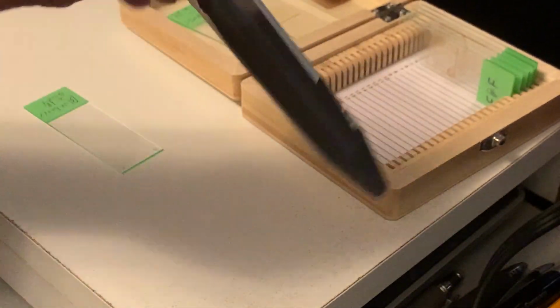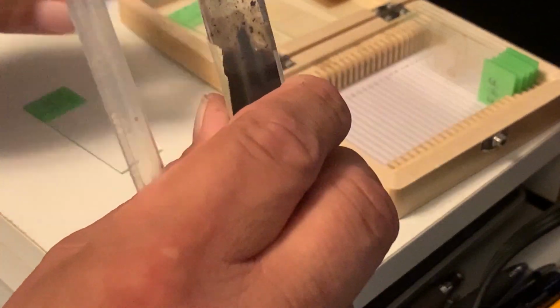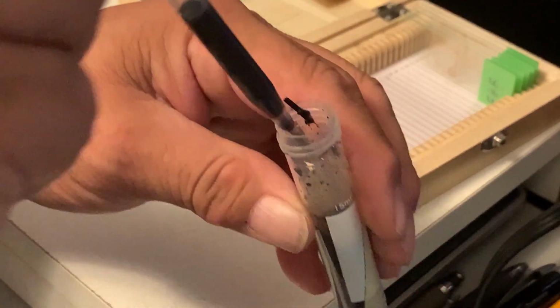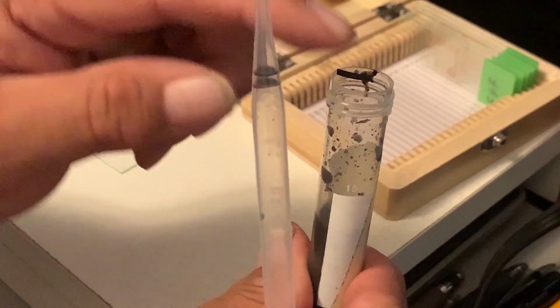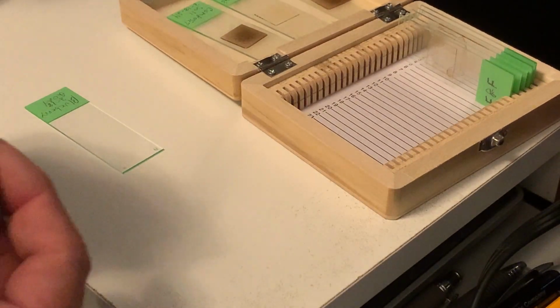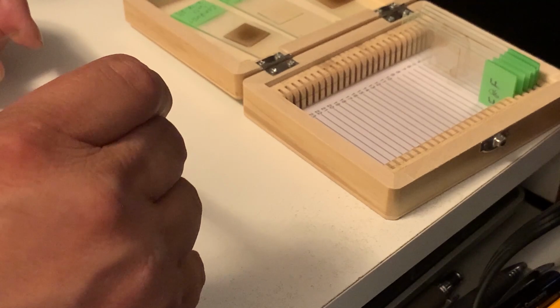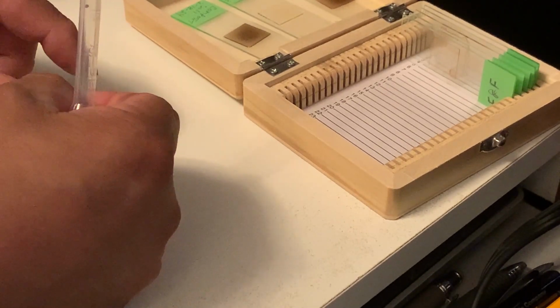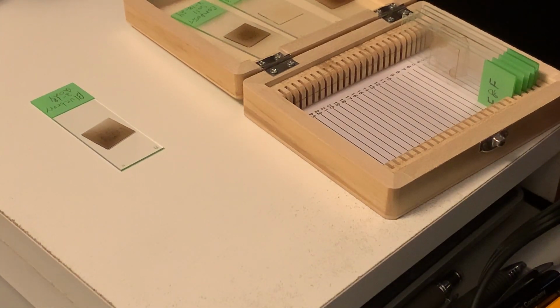Okay, so now we're going to do our last one. The blueberry. Gentle rock. And then we're going to extract the sample. Extract sample. And then get a cover glass. Put a little droplet. 45 degrees and just drop it. There. All right, now we go to the microscope.